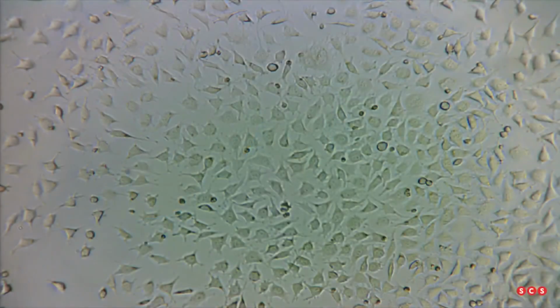Who of you knows what you can see on this image I'm showing you right now? I guess most of you have a pretty good idea of what that is. It's a couple of cells. To be precise, it's a microscopy image of L929 cells. That's a type of cell that is often used to assess the influence of new drugs on cancer growth, for example. And the key point to assess there is usually the cell count over time.